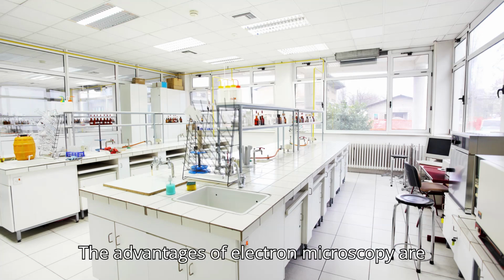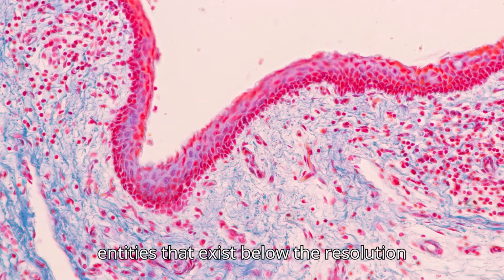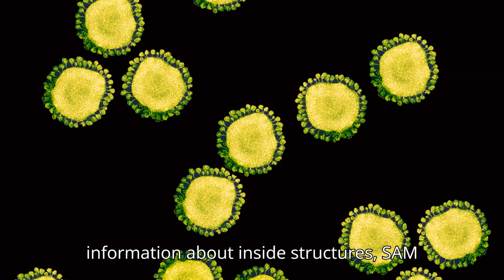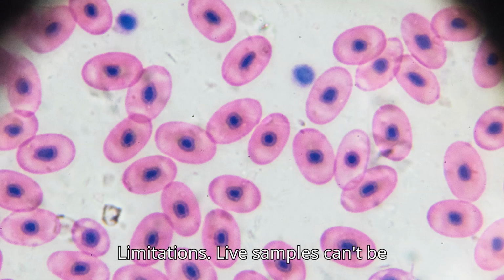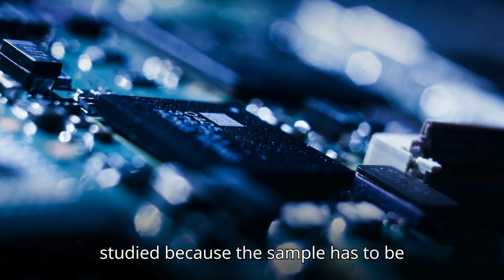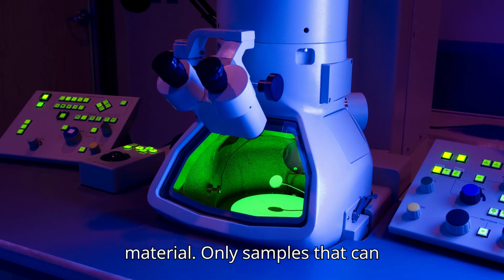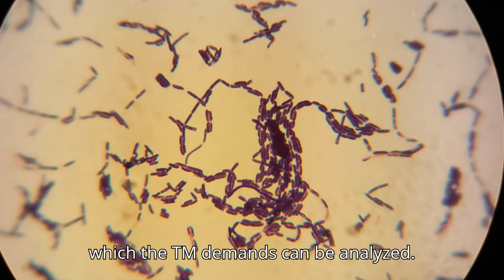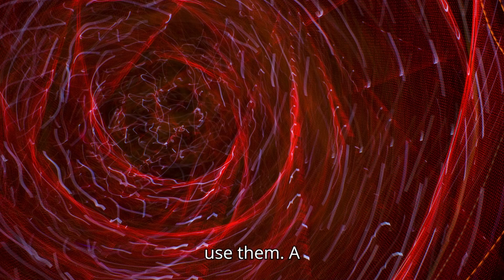The advantages of electron microscopy are its very high resolution, which allows it to visualize viruses, single molecules, and entities that exist below the resolution of light microscopy. While TEM gives information about inside structures, SEM gives a complete surface topography. Limitations: live samples can't be studied because the sample has to be fixed, dried, and frequently coated with a layer of metal or some other conducting material. Only samples that can easily be cut into the thin sections which TEM demands can be analyzed. Expensive, with some training needed to use them.